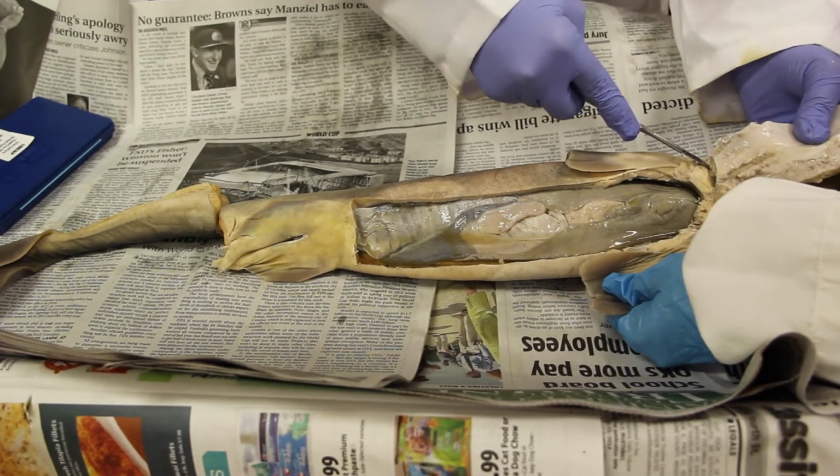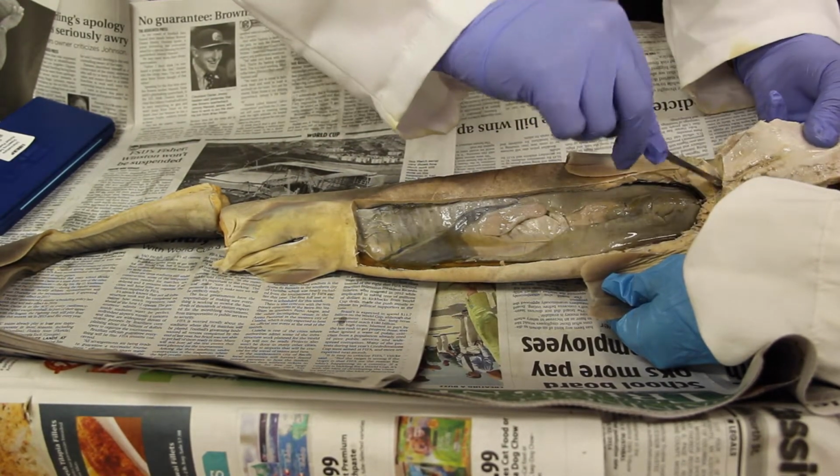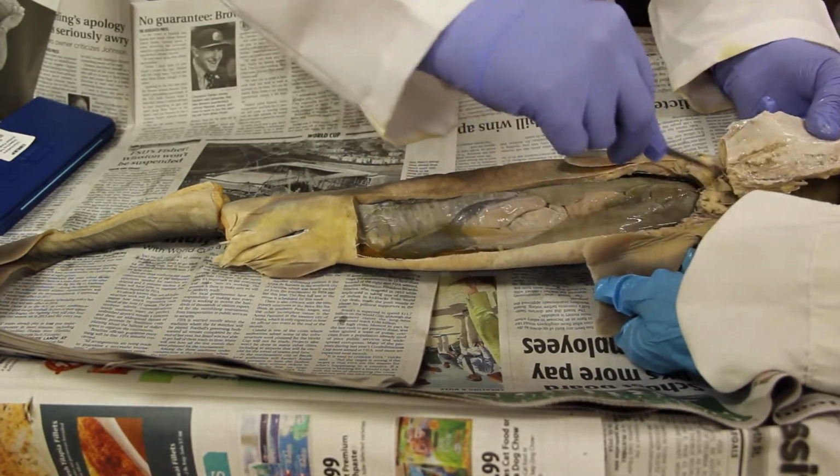Now we're just going to cut it off just so you guys can see it easily. Usually you would not cut it off, but you can just check with your teacher on that.